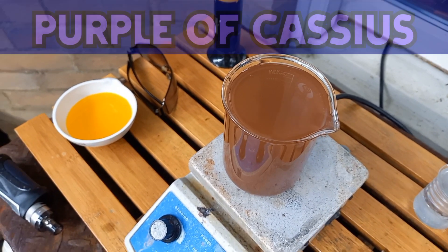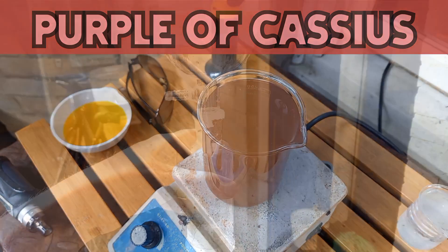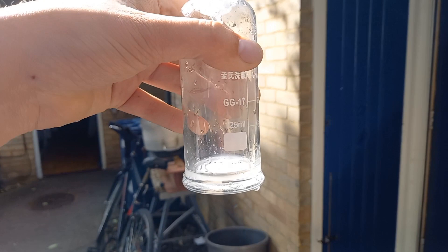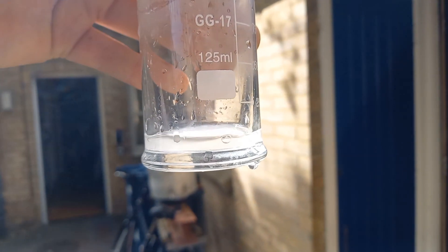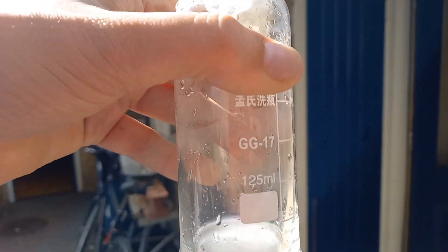And that is gold when it has a small particle size. Definitely got red there. Interesting. It's probably going to catch those particles and give me a clear solution.